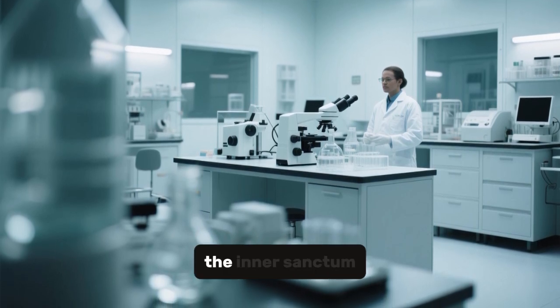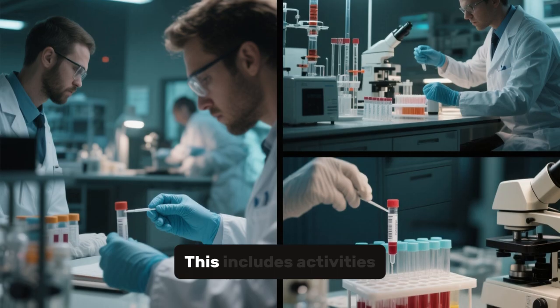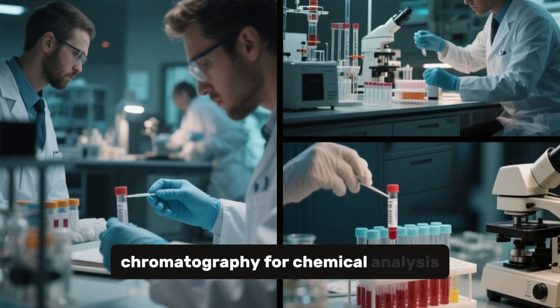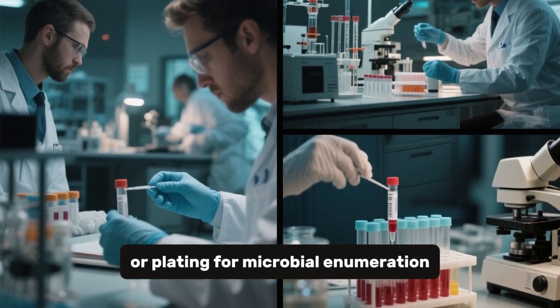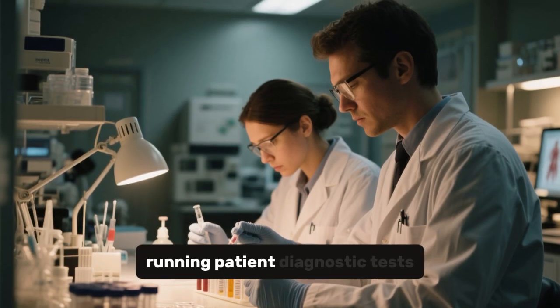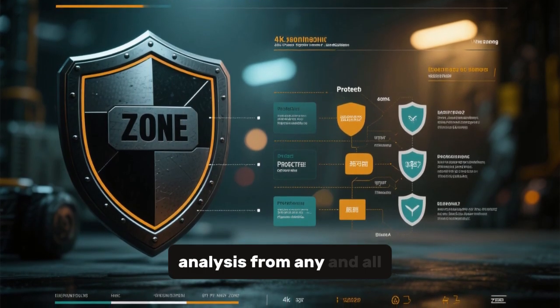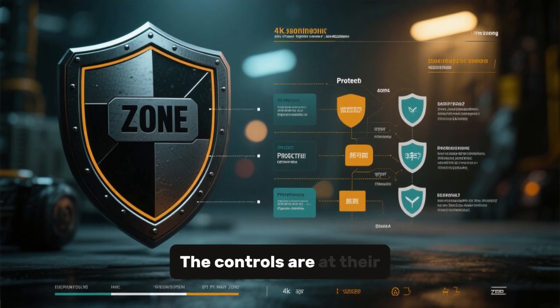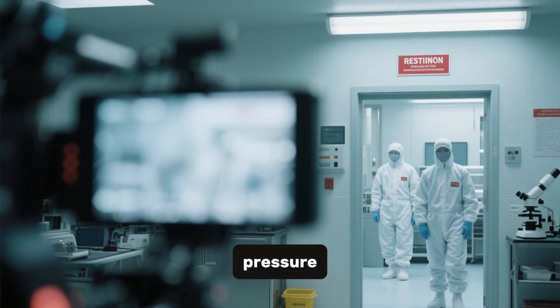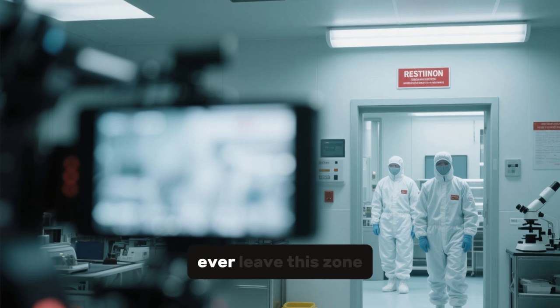Finally, we arrive at the heart of the laboratory, Zone E3. This is the clean zone, the inner sanctum. It's where the most critical and sensitive analytical work happens. This includes activities like PCR for pathogen detection, chromatography for chemical analysis, or plating for microbial enumeration. In a CLIA-regulated clinical lab, this is where you'd be running patient diagnostic tests. The goal of Zone E3 is to protect the analysis from any and all contamination. The controls are at their peak here. Access is often restricted. There might be positive air pressure, and you'll absolutely need dedicated equipment, pipettes, and lab coats that never, ever leave this zone.